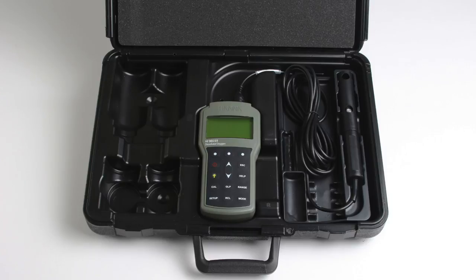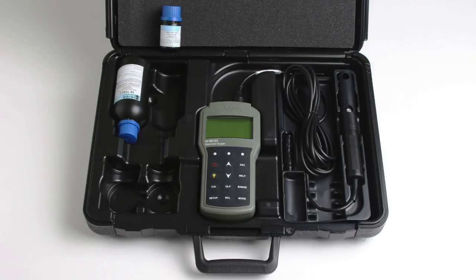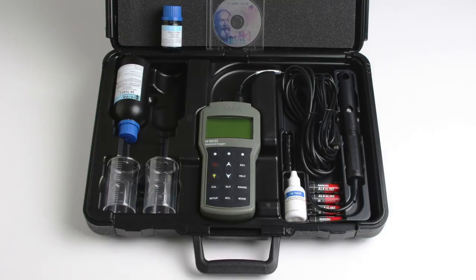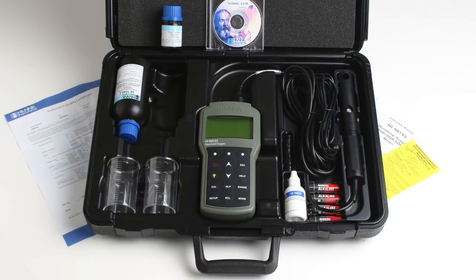Two membrane caps, two-component zero oxygen solution, one bottle of electrolyte solution, two plastic beakers, four AA batteries, a micro USB cable, Windows compatible PC software, an instruction manual with quick start guide, and the instrument quality certificate.